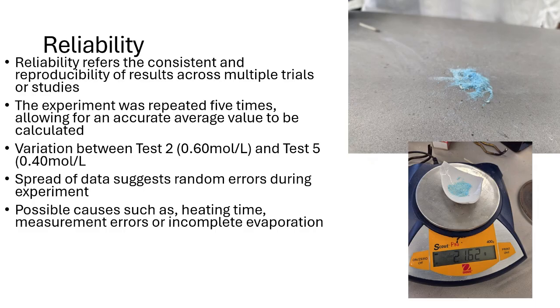The outlier used the largest initial volume of copper sulfate solution. However, it produced the smallest mass of pure copper sulfate. This makes it most likely that this outlier was due to either boiling the solution for too long or loss of mass when pouring solutions. A green flame was observed while heating. Green flames occur when copper sulfate is burnt, which can occur during spilling. More trials can be performed to increase reliability to further weed out outliers, creating a more statistically reliable average concentration.